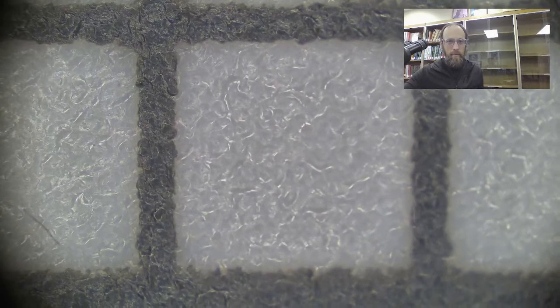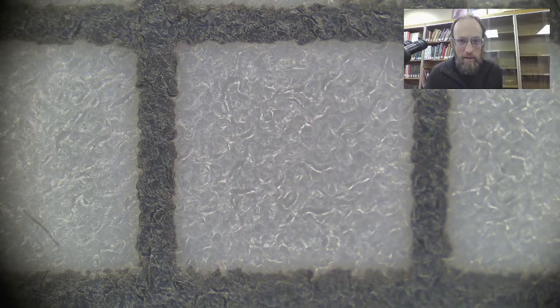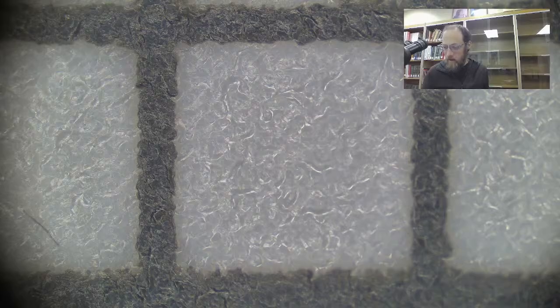Alright, so just for scale, and this is handy for me too, I'm all the way maxed on my microscope here, which is just short of 80 times magnification. So what you're looking at there is a square that's 2 millimeters by 2 millimeters.